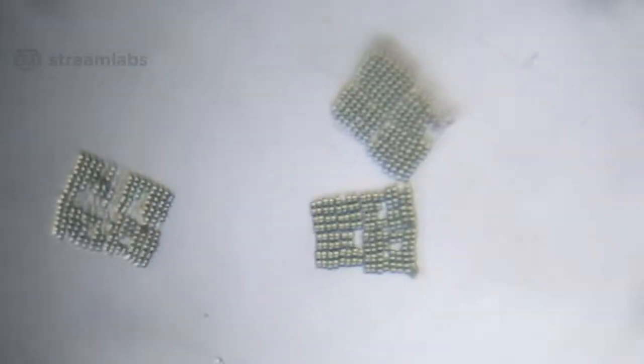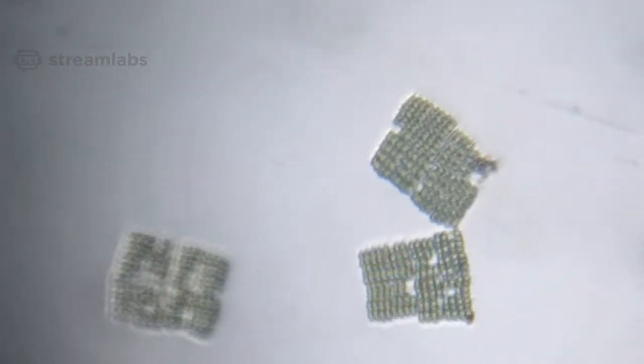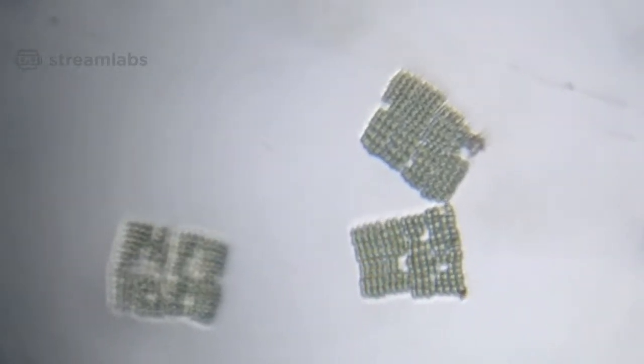Oh, now look at this. This looks like a circuit, doesn't it? Yeah, this looks like an electronic circuit. Wow, look at this. How fascinating is this? They're so beautiful. And yeah, cool. These are cyanobacteria too, but they don't make those heterocysts, those special cells. But they might have something special.